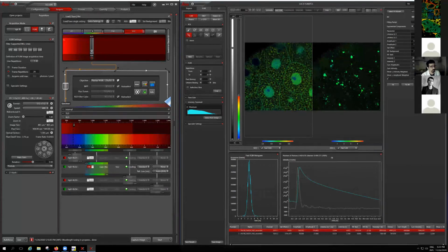I have no idea what they are. Maybe they are also nuclei, but they look different. Maybe they were just in a different plane, so it was roundish. It's a 3D sample, and this part as well. Maybe there was some damage in the tissue. So I would just discard these parts.